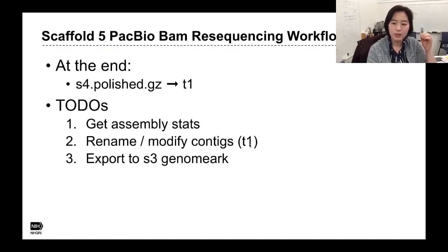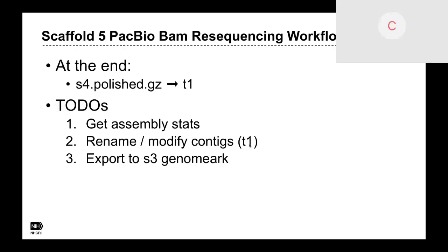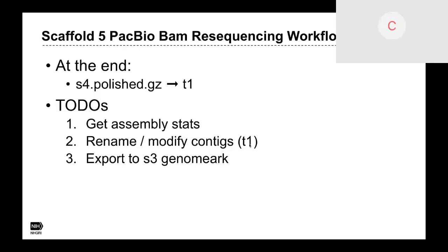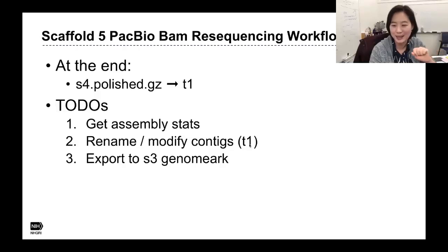But I saw that for some genomes that option didn't work. So I think we have to make an option to try that first and then go back in case it fails. When you mentioned that option in the SALSA, is it at the ARIMA or at the SALSA step? I mean, running the BioNano hybrid scaffolding. Oh, I'm sorry, I was confused because I heard you say Hi-C. Yeah, it's confusing because the option, the XML file, contains Hi-C in the name.